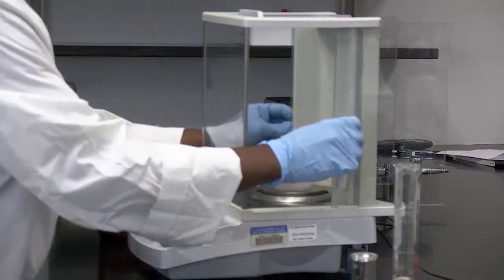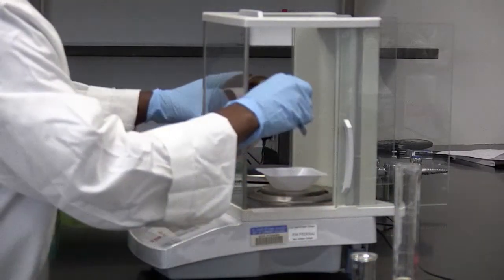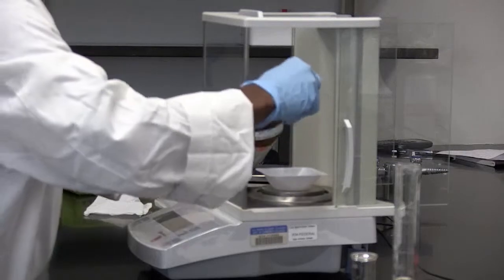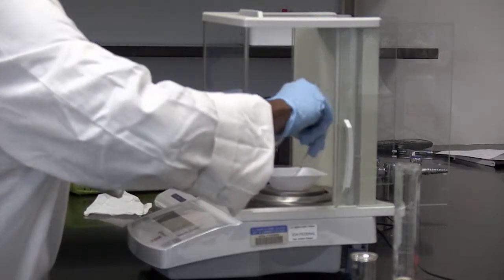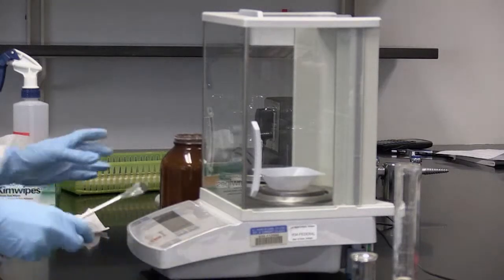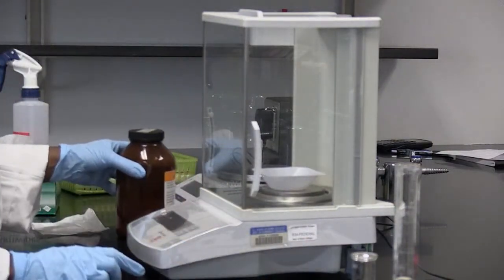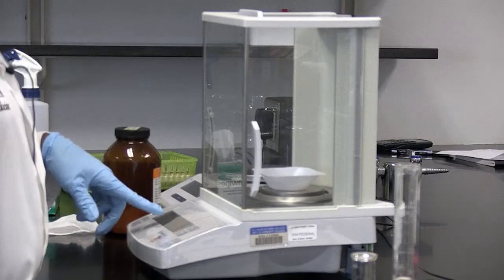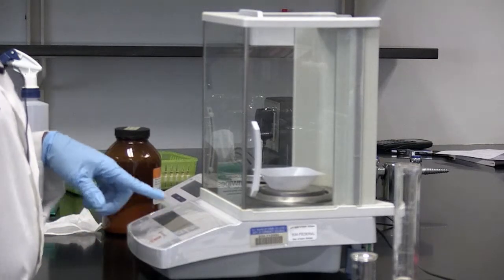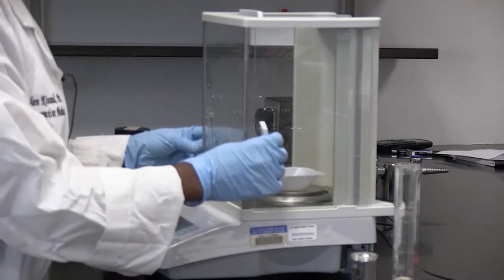So I'm going to start by weighing out 1 gram of potassium hydrogen phthalate, or KHP. And again, I close the two doors to make sure. Right now, I am going to record a mass of 1.004, because on the screen it's displaying 1.0038 grams. If I round it to the nearest decimal point, it's going to be 1.004 grams. So that's the mass of KHP that I'm going to be using.